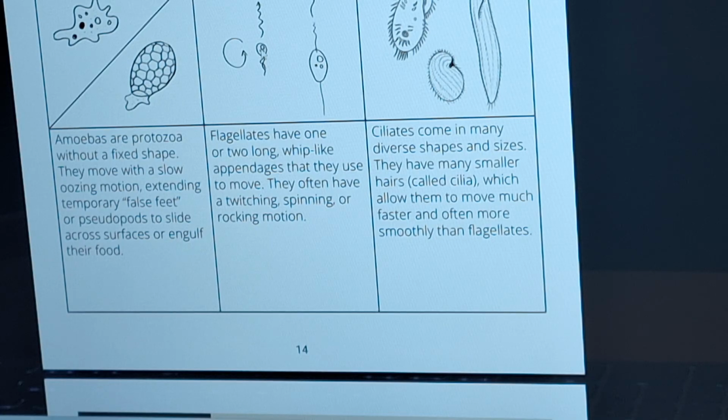We can tell them by their motion. They either zigzag or spin around because they have one tail. That's called a flagellum. They have that one flagellum behind them, and that's the way they move through the water, the material itself.